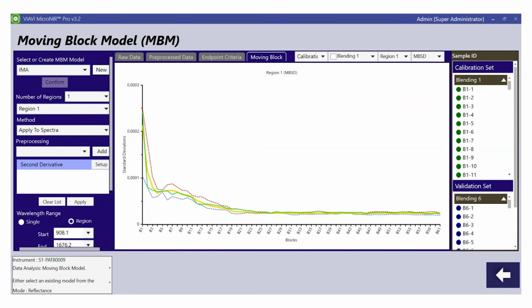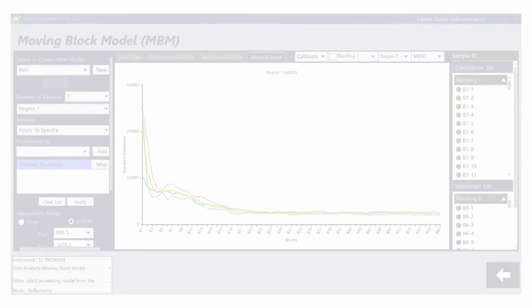You just need to look at where your profile is lying. If there is an overlap with the golden batch, it is fine. Or if you see that you are going out of one of the two dashed borders, it means that there is a red flag that needs to be investigated in the laboratory.